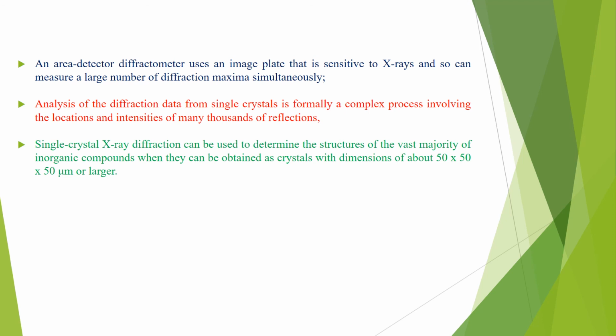Single crystal X-ray diffraction can be used to determine the structure of a vast majority of inorganic compounds when they can be obtained as crystals with dimensions of about 50 by 50 by 50 micrometers or larger.